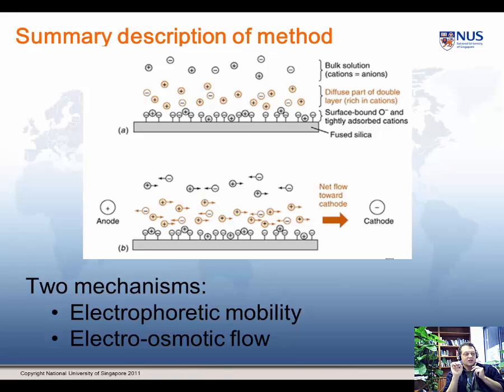We now actually apply a potential difference between the anode and cathode of this cell, and unsurprisingly ions of one charge move to the electrode of opposite charge. It's worth noting that this is a driven cell.